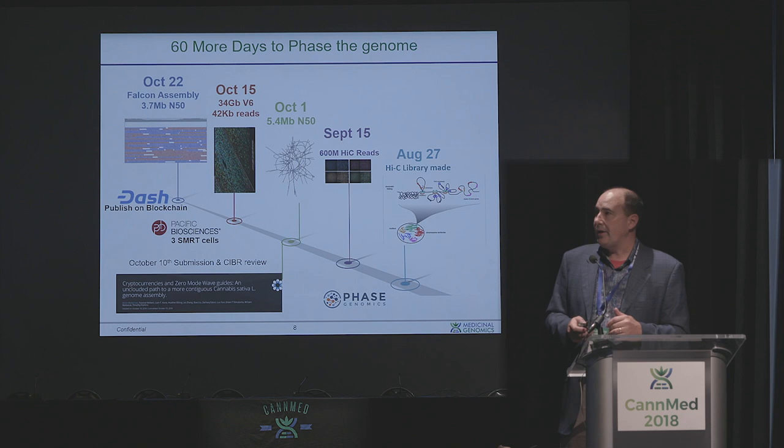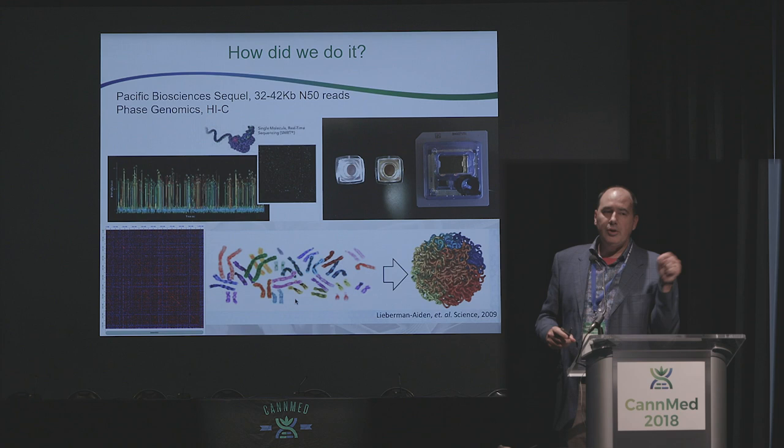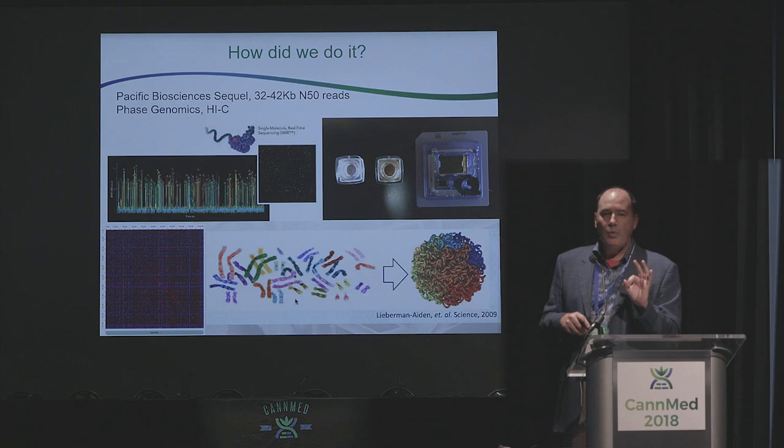So what are these platforms? Sarah gave a great talk in the other hallway on what Pacific Biosciences is. These are single molecule sequencers. So that trace you see up there is actually a single molecule going through a zero mode waveguide with a polymerase that's putting in fluorescently labeled nucleotides, and you are watching a movie of a polymerase replicating DNA at a single molecule level. It's absolutely mind-blowing Star Trek stuff. And they can do millions of these wells at a time, which is fascinating.